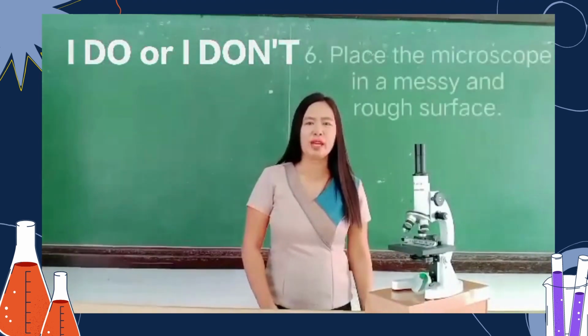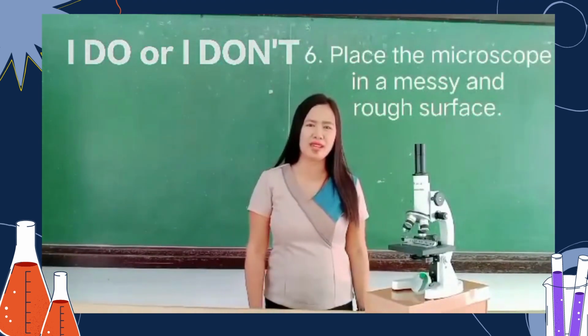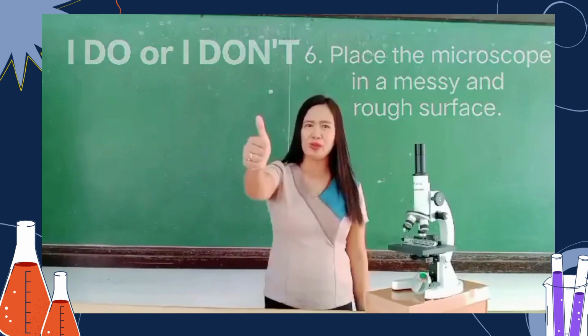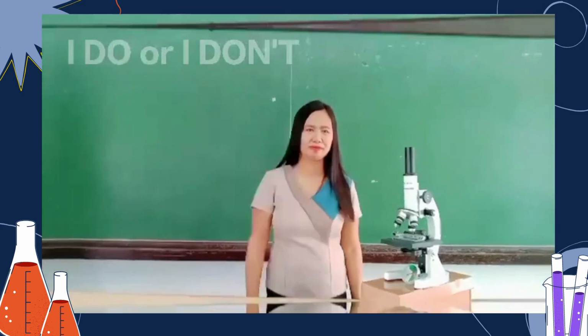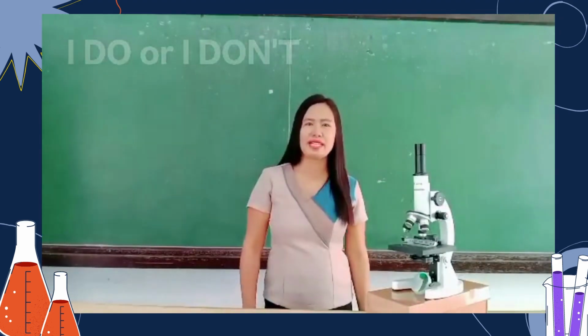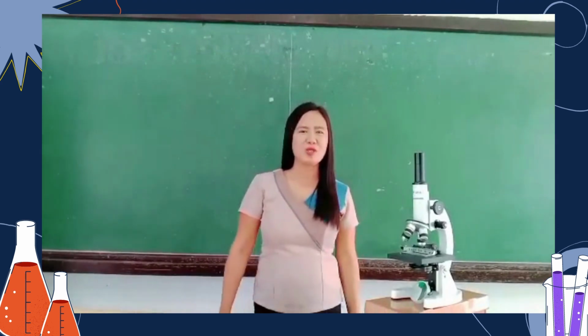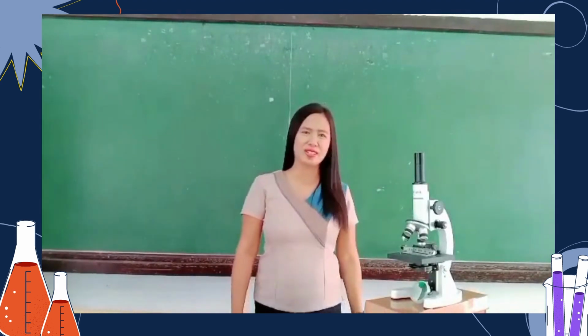Number 6. Place the microscope on a messy and rough surface. I do or I don't. Yes, the answer is I don't. Job well done, students. Congratulations!